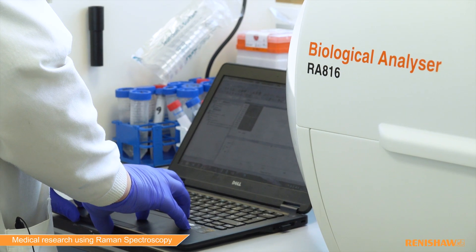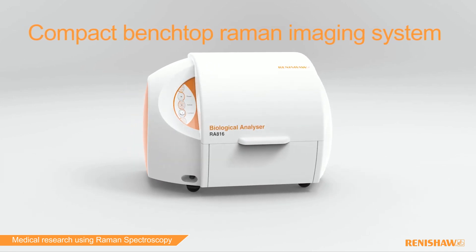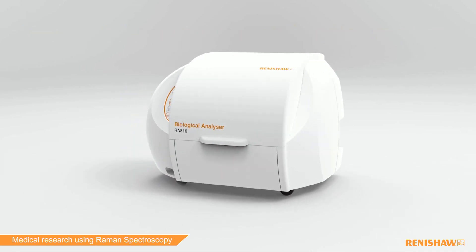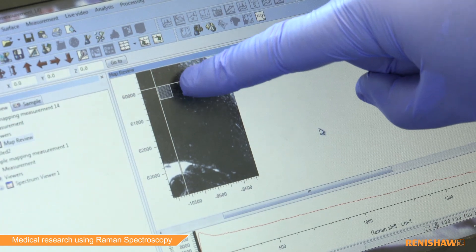The Renishaw Biological Analyser is a compact benchtop Raman imaging system designed exclusively for the biological community, redefining tissue and biofluid analysis. It is easy to use yet gives rich biochemical information about the samples being analysed.